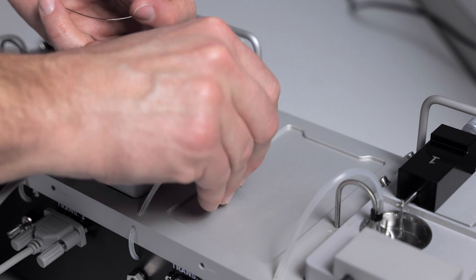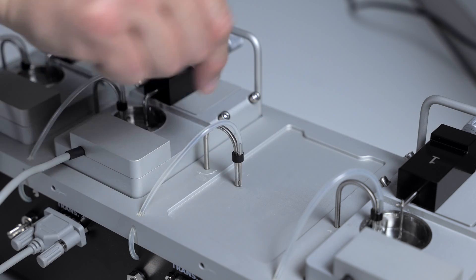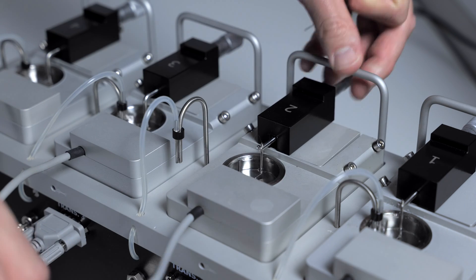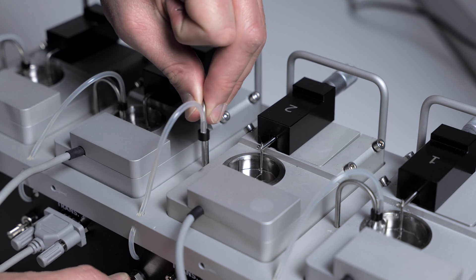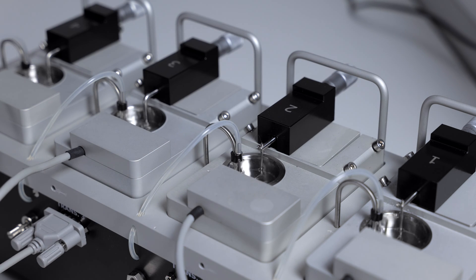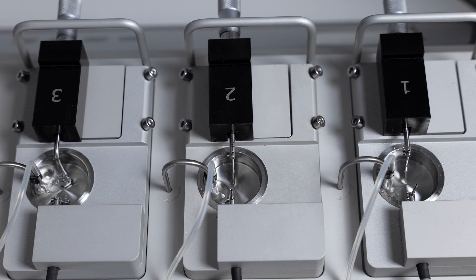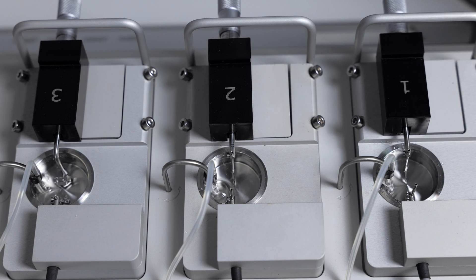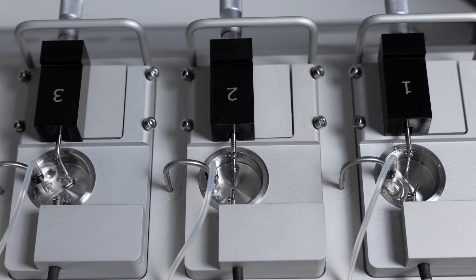Then you can reattach the silicone tubing. Check the chamber. Check for bubbling. At this point, all four chambers should be bubbling. If it is not, please contact your DMT representative for additional troubleshooting.